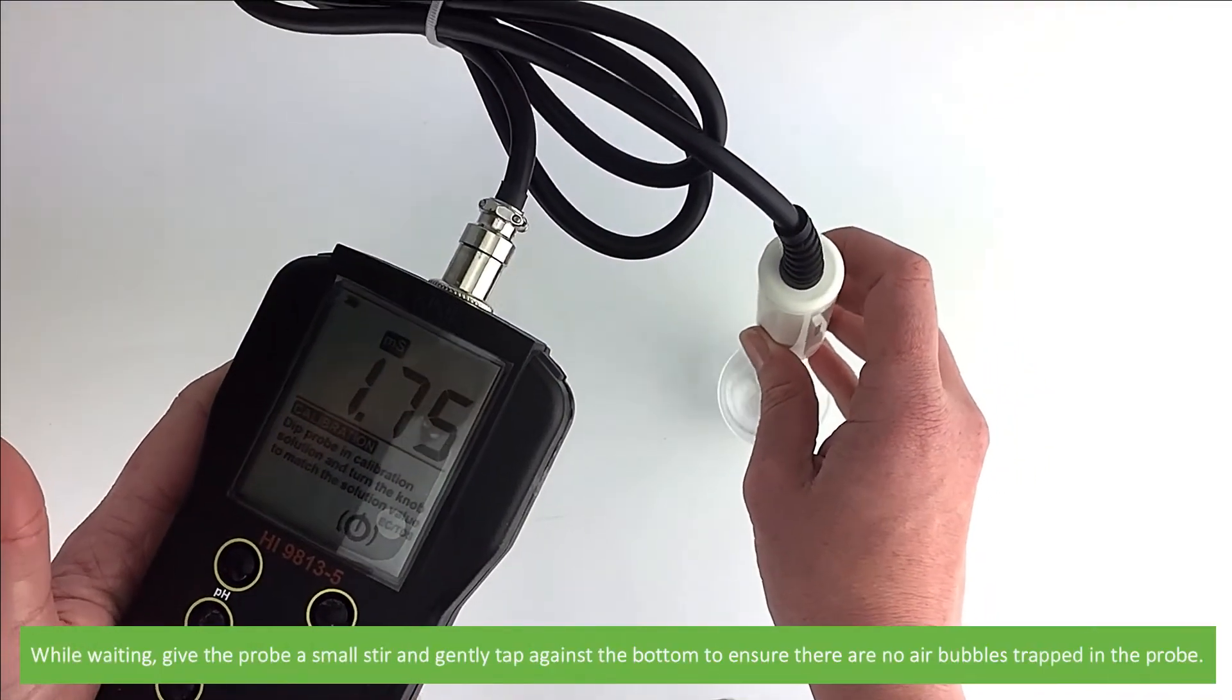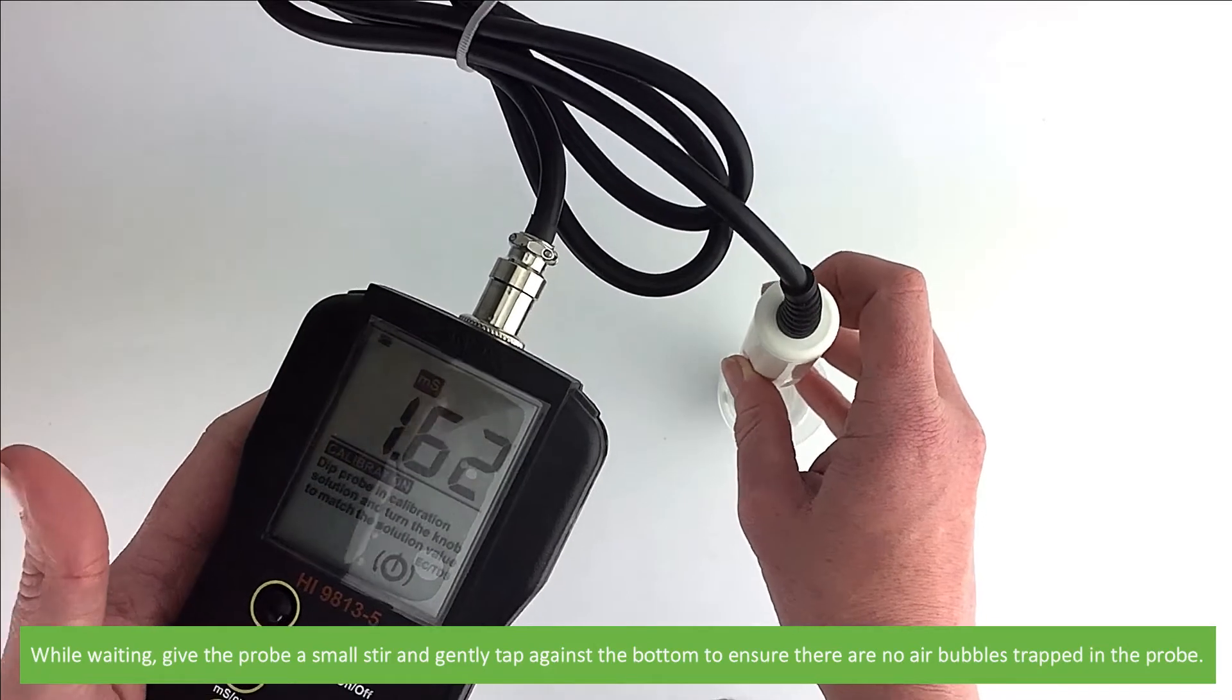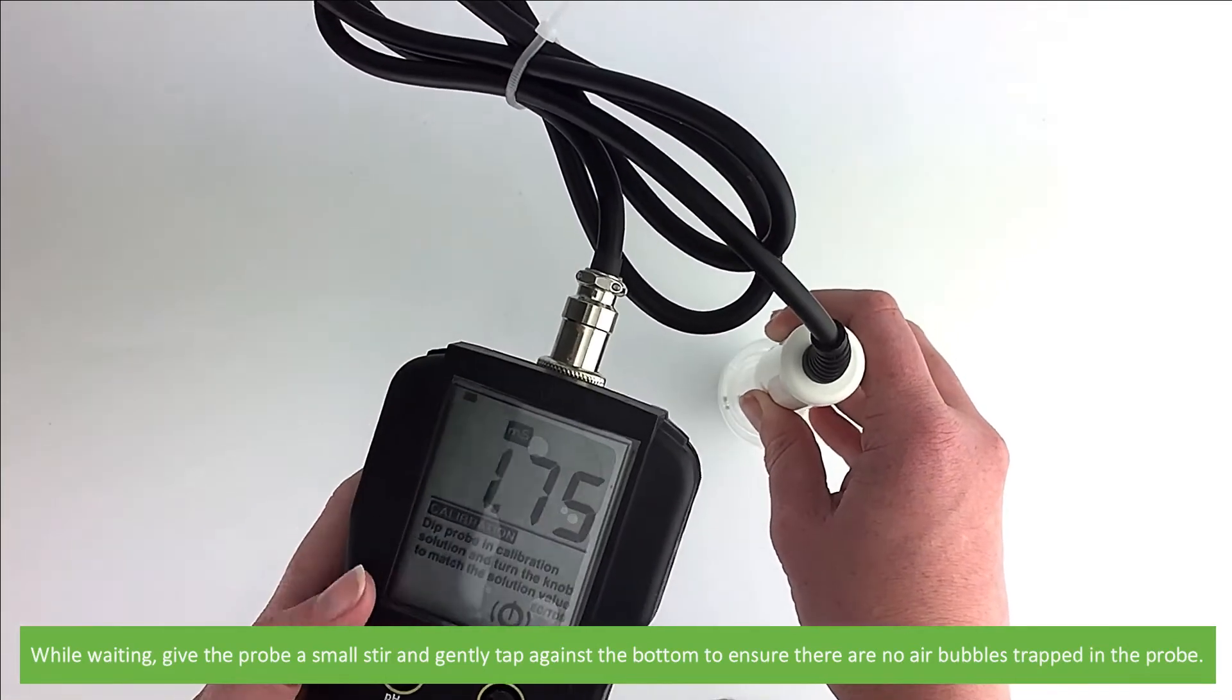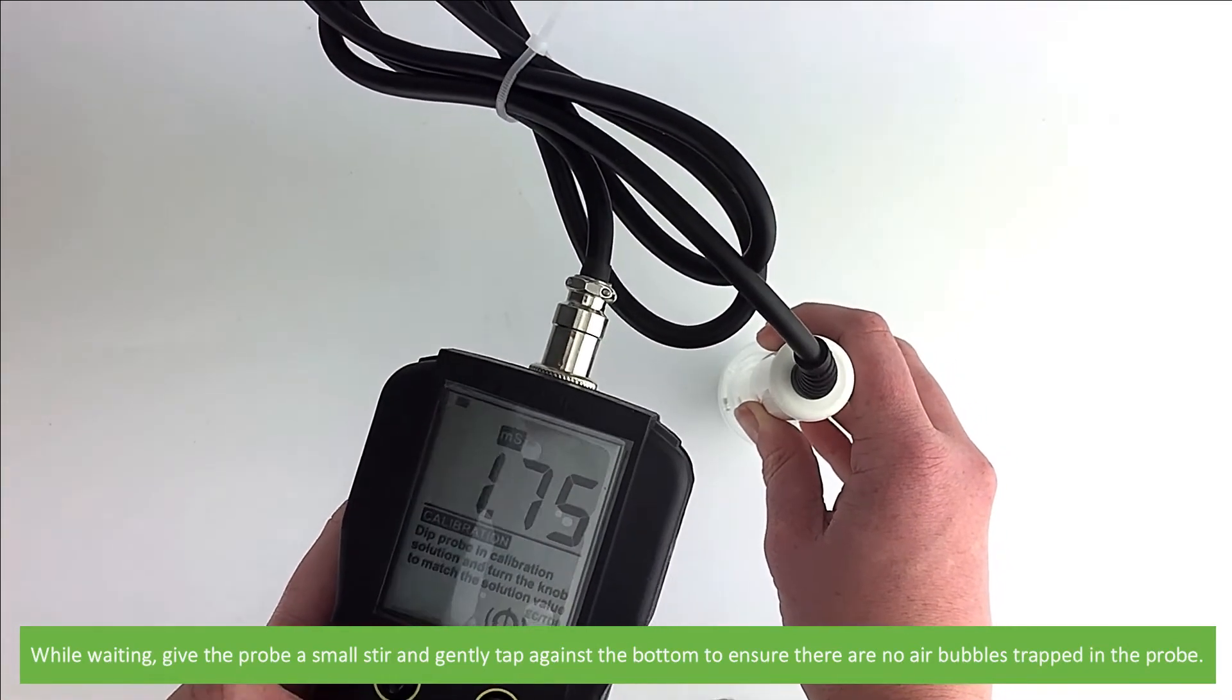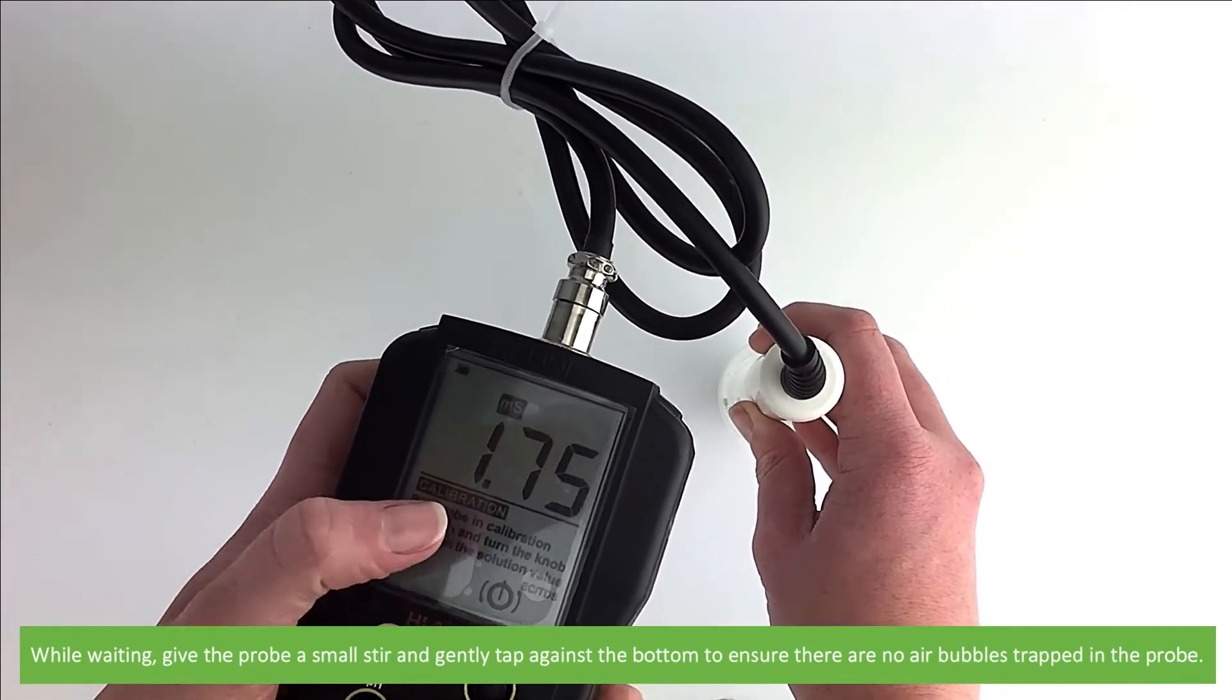While waiting, give the probe a small stir and gently tap against the bottom to ensure that there are no air bubbles trapped in the probe.